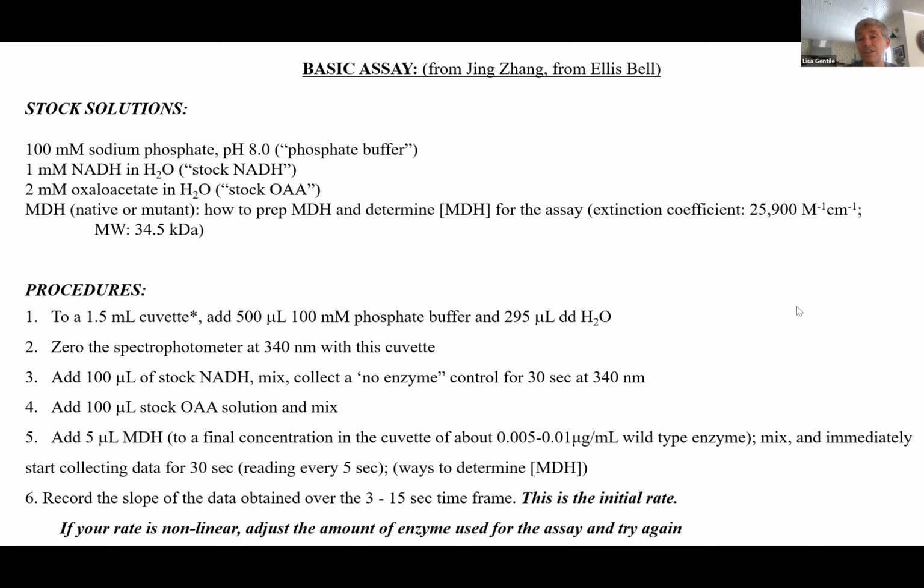And what I found is that in working with students, this takes a lot longer than I think it will take. And so if you can have one lab period where they're just playing with this, just getting comfortable with this, just figuring out how to get data and how to get on the curve, so to say, and then the next lab period, they can actually collect 3 or 4 or 5 replicates of that data so that they can have some error analysis. That's kind of a good compromise.